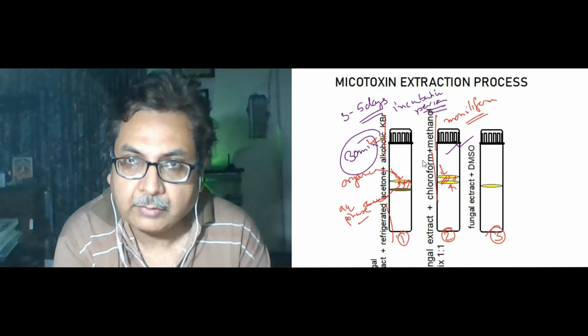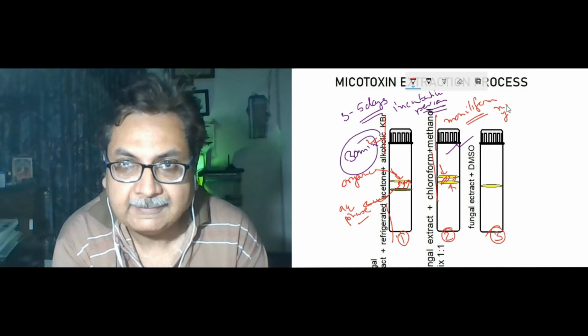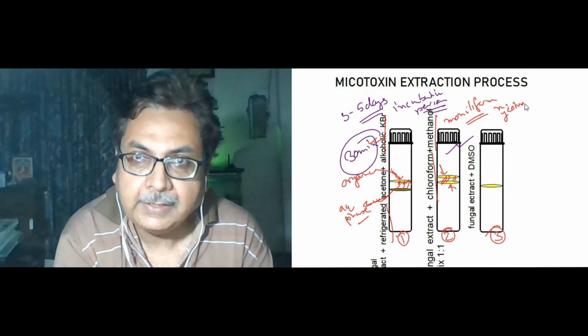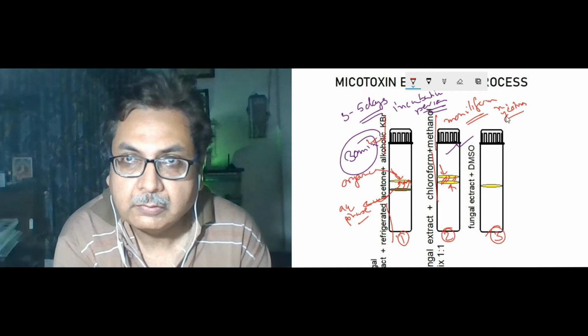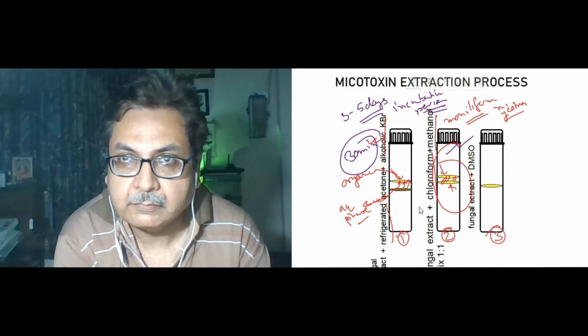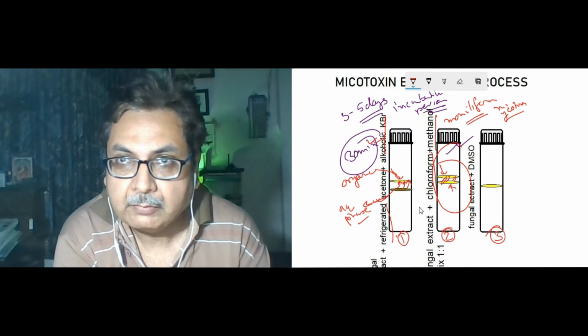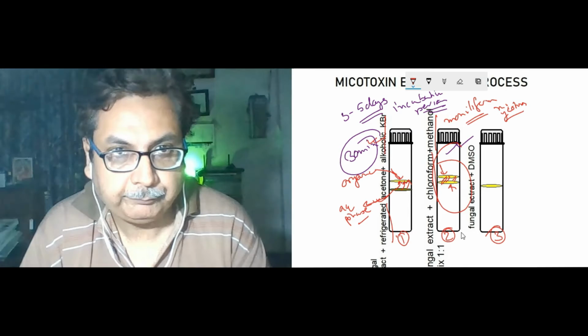It also has an organic phase layer and an inorganic phase layer, and the phase extraction is done. But this is only used for moniliform mycotoxin.